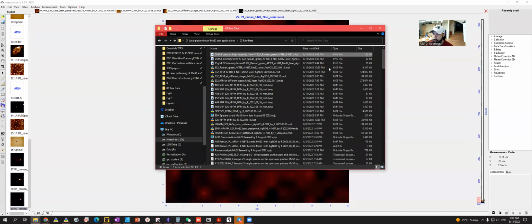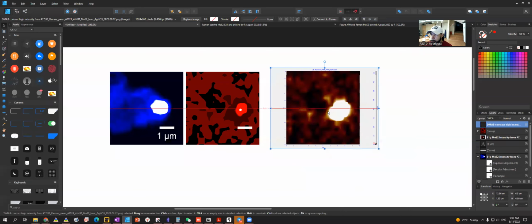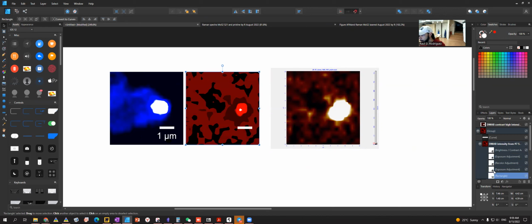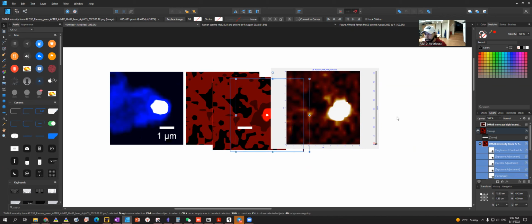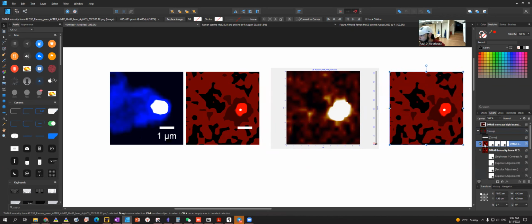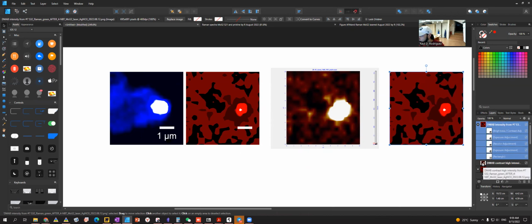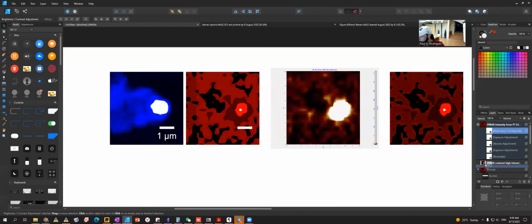Then that is here, comes here. And what I'm going to do, you could either repeat and apply all these filters, or what I prefer to do is select these filters. One way to do it, you can duplicate this one, then put it to the top. And then you have this one. Then you can start moving things here. Which one do you duplicate? I forgot.